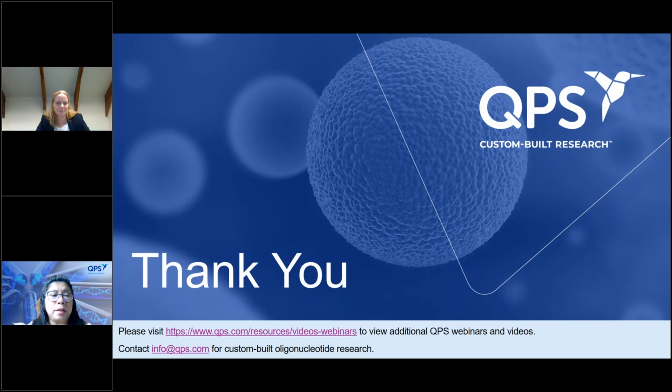Okay. And the melting point calculation does not count modifications like LNA, PS. So how is the melting point estimated? So of course, you can make a calculation for yourself, but when you design the probes, it's also good to keep in contact with your probe oligonucleotide synthesizer. So the company that makes your probe, what we normally do is we show them upfront which probes we designed, and they come with also a good estimated melting temperature.